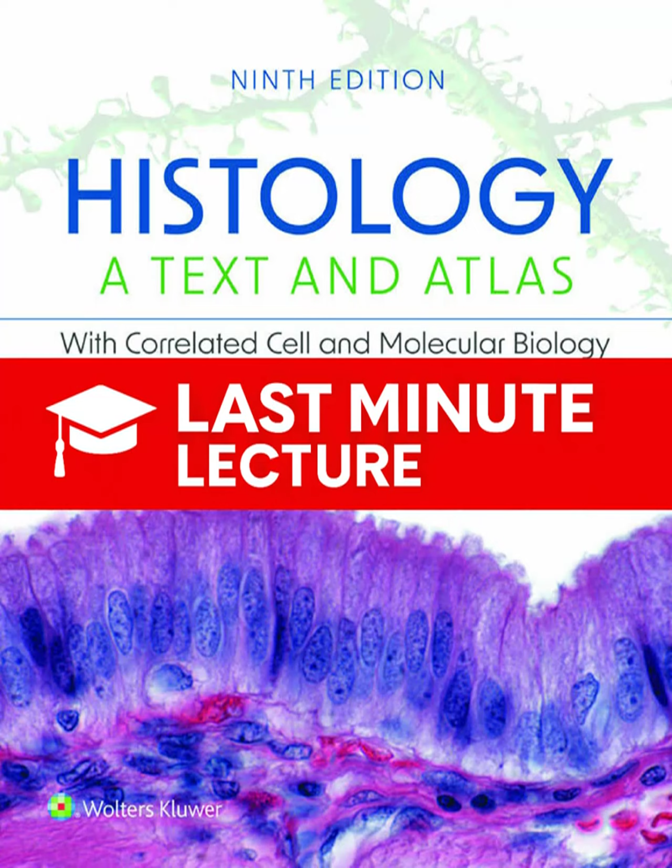And finally, we have to mention artifacts, those things that confuse every beginner. Artifacts are just defects. They're caused by errors in the preparation. Maybe the fixation time was wrong, or the reagents were contaminated, or there was physical damage from the knife, or poor mounting. A good histologist has to learn to recognize these flaws, like shrunken cells or folded tissue, so they don't mistake them for real biological structures.